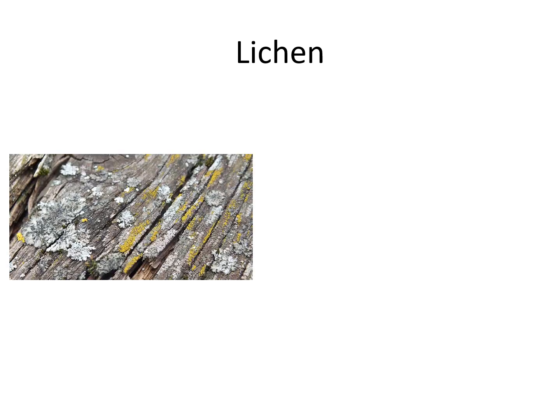The last slide you will look at is of a lichen. And a lichen is something that you have actually probably seen, especially on trees. It looks like a mold that is growing on the bark of trees. Sometimes it's gray or bluish or green, and that is a lichen. It's an organism that is a combination of a fungus and algae.